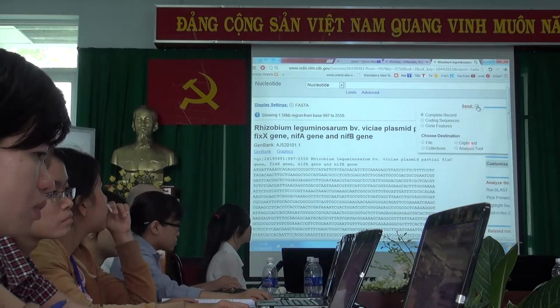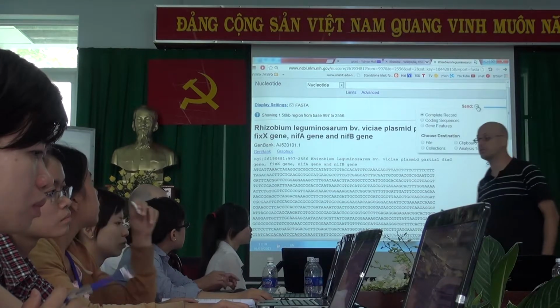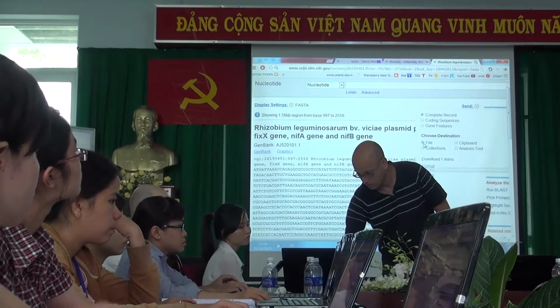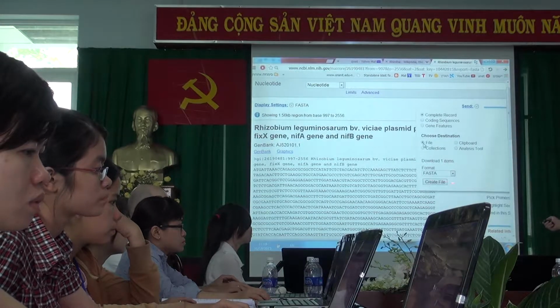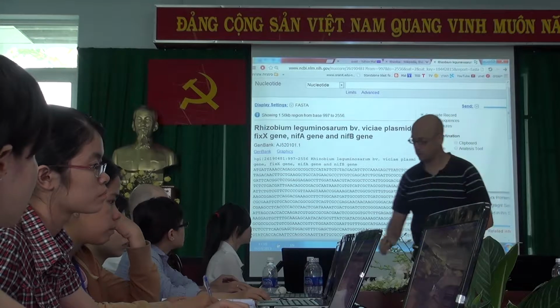To a file, to the clipboard, to the analysis tool. Let's try the file. We click on File. And now it asks which format do we want it in.